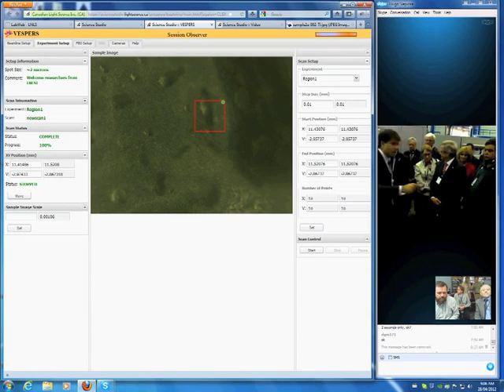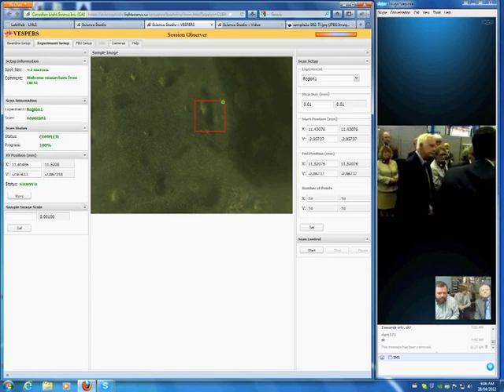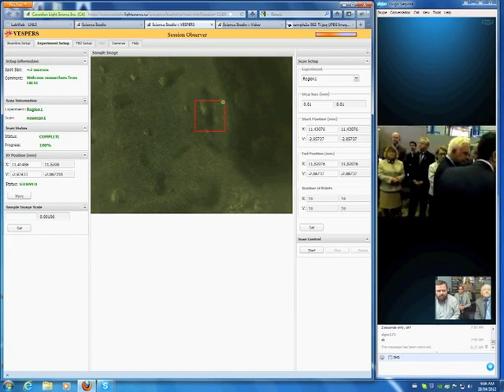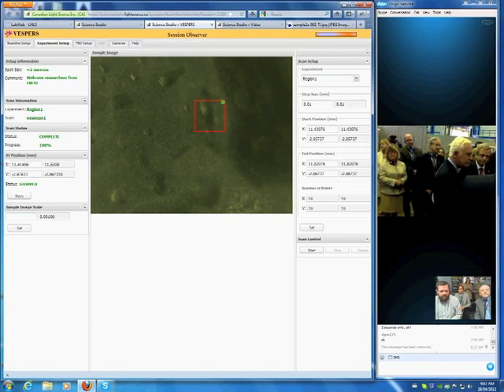So what you see there is a picture of software in development. It's the same kind of experiment that we did into Science Studio, which is the platform developed by the Canadian Light Source, right? The product of the Canadian Light Source, and we are in. So that's a two-part operation. Exactly.